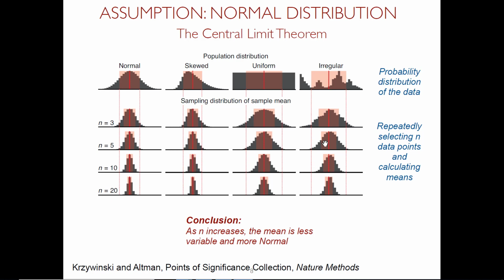About the mean distribution, we're talking about that per protein, right? We're talking about one protein. So for my whole discussion right now, I only have one protein. I have multiple replicates, yes, but I only have one protein. But let's say in a shotgun proteomics, where you talk about a normal distribution for every protein across your sample, each protein has its own variance, right, and so on. And it can have its own missing values, so it will change the sample size, right? I mean, you also see that usually there's a normal distribution per patient, let's say. This is less of interest to us, right?